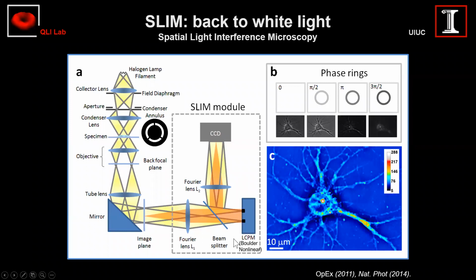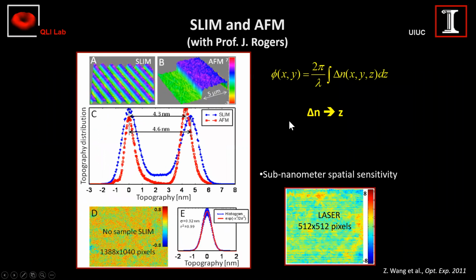And these are almost perfectly overlapped, meaning the vibrations, there is only one set of optics that both of them go through. The air is about the same. And basically that's why it's very, very stable. So we tested this initially when this paper came out, when SLIM came out.